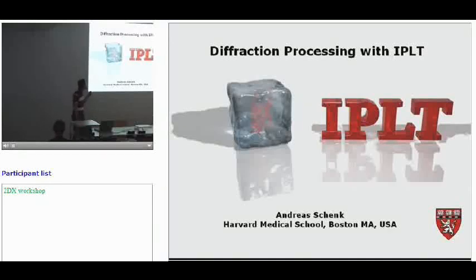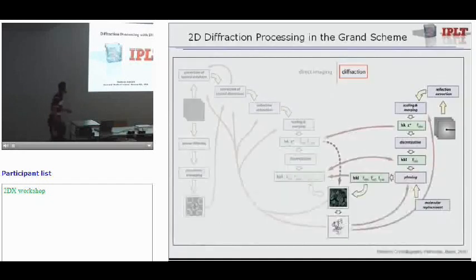Today I will be talking about diffraction processing using IPLT. Some of you already saw it yesterday in the hands-on practicals. So we get now a little bit more details on what is going on in the background behind the graphical user interface, how the things are done. For the rest of you that haven't seen it yet, there will also be an introduction on how the graphical user interface works. And you will see it this afternoon in the practicals.